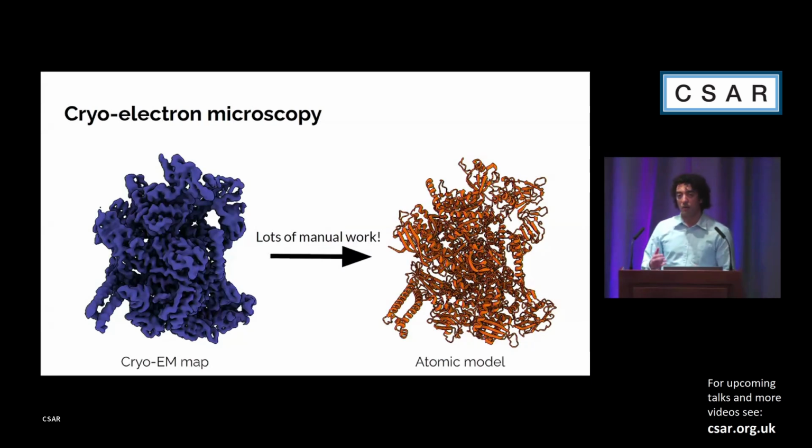map. So how do you actually get the atomic model from that volume? You get your biologist and have them stare at the volume and also use what they know about your protein, and then basically place atom by atom the full atomic model. This can take months of manual effort and require very, very specialized skills. Usually, it's the biologist who's working on the protein who does this.